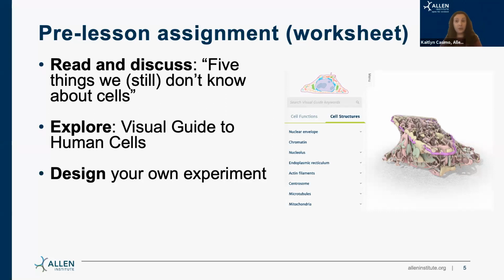They then explore the visual guide to human cells that Graham showed you. And then they start thinking about designing their own experiment. What are the applications and limitations of the methodology that they're learning about?